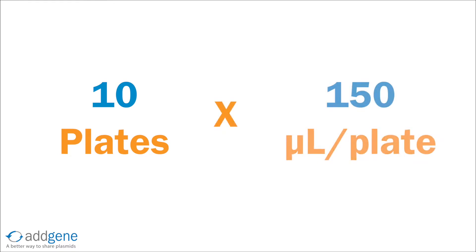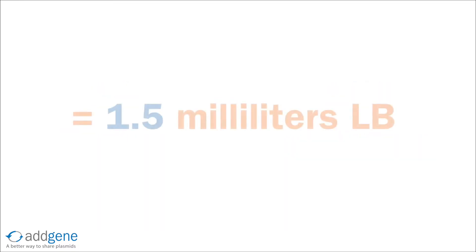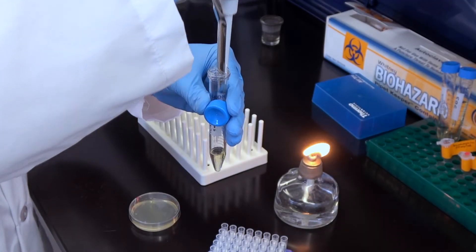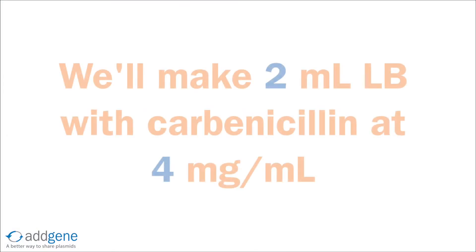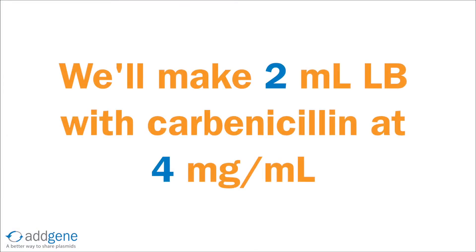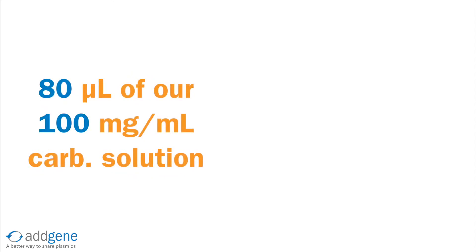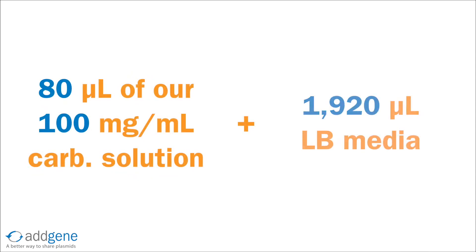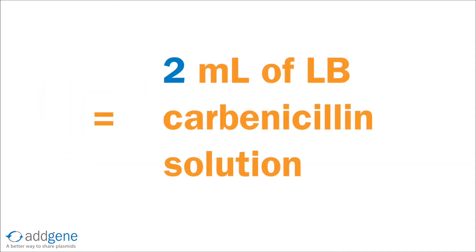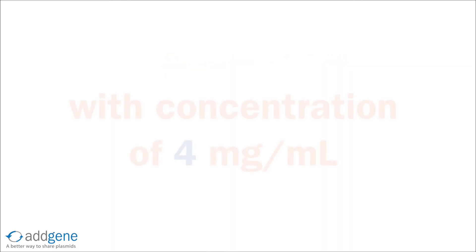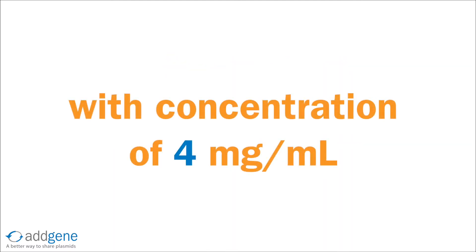For example, if we were making 10 plates, we would need 150 microliters per plate, equaling 1.5 milliliters of LB. It is always good to make a little more than we need, so we'll make 2 milliliters of LB with carbonicillin at 4 mg per milliliter. We simply dilute 80 microliters of the 100 mg per milliliter stock solution into 1,920 microliters of LB for a total of 2 milliliters, giving a final concentration of 4 mg per milliliter.